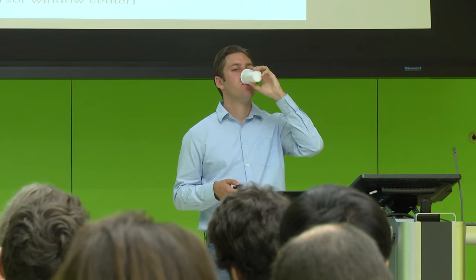Okay, so this is another quick question, and maybe we've got all the experts in the room. I always wondered, the original SWATH paper describes the margins, but those margins only protect you from signal drop-off. They don't actually protect you from splitting the isotope distribution. You would have to make the right-hand margin even larger. If you're trying to get singly charged peptides, you would have to make it 3 mass to charge wider, if you wanted to get all the way to the M+2 peak on the fragment ion.